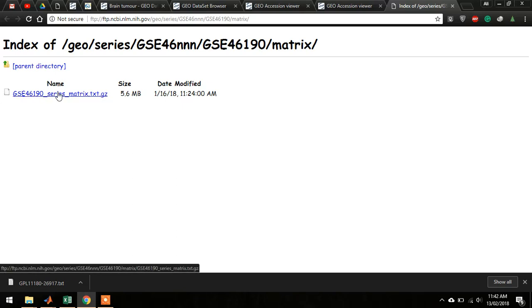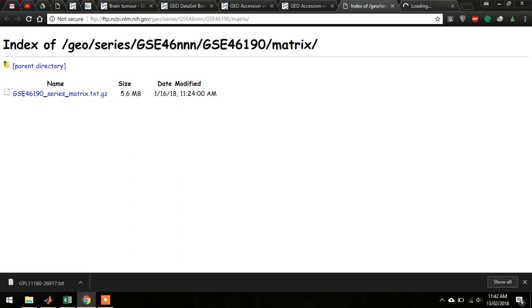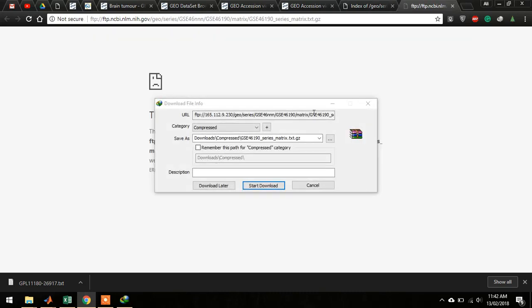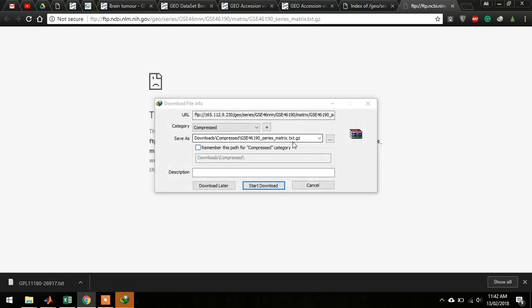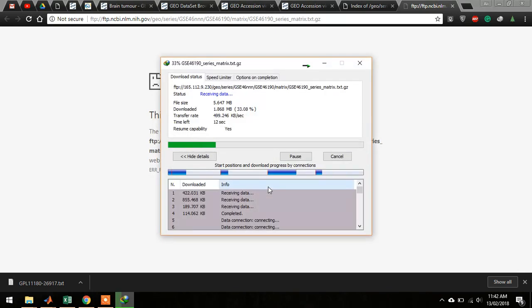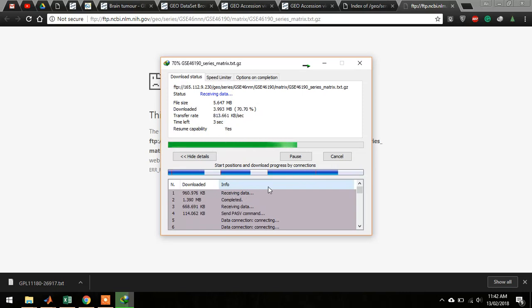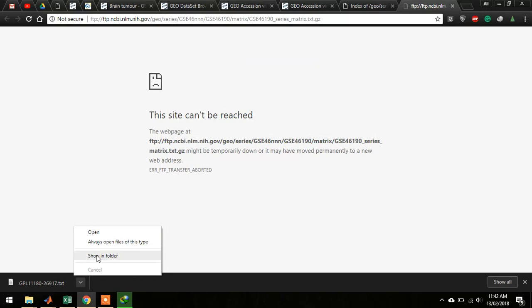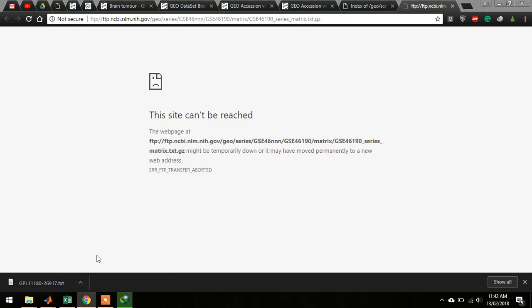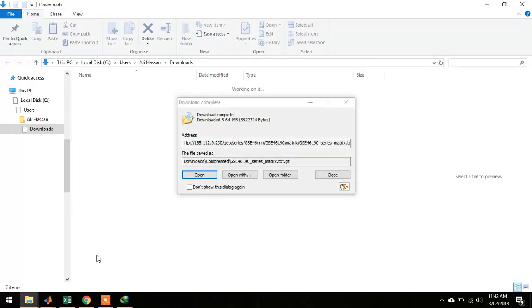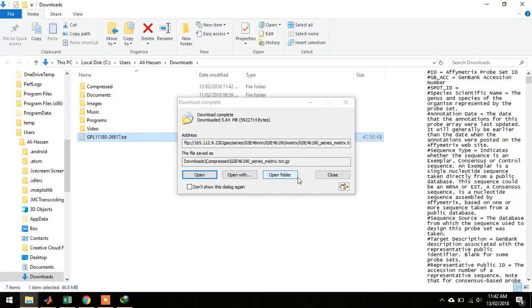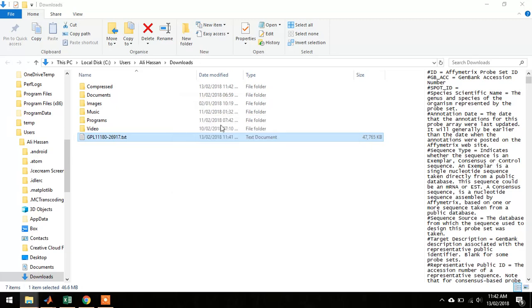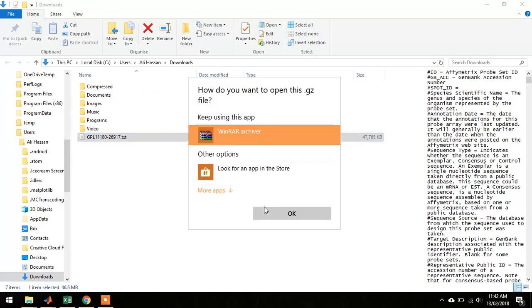Once you click this link, you will download a compressed file, and you can extract it using WinRAR or WinZip. Just go to this file and get this one.